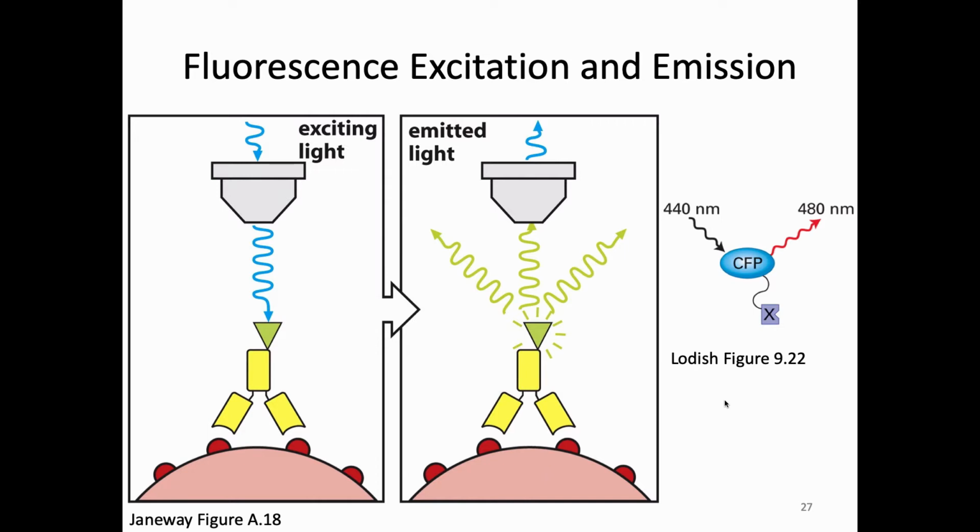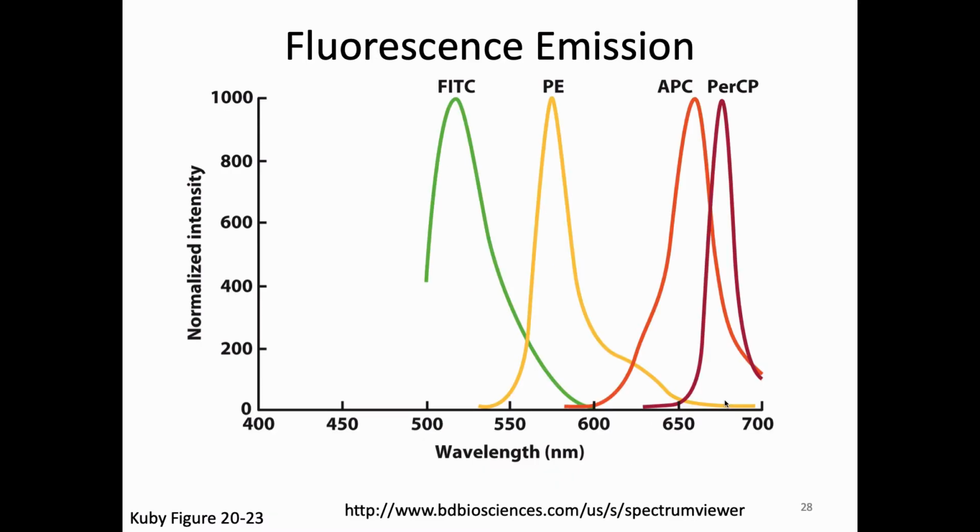And so you can actually look at the emission off of the dyes that are on the Fc portion of the antibody. I know, for example, that the cytometer that we have can detect light that's coming off at 522, I think that is, 564, 6-something, and 6-something else. Those are the 4 colors that our cytometer can actually detect.